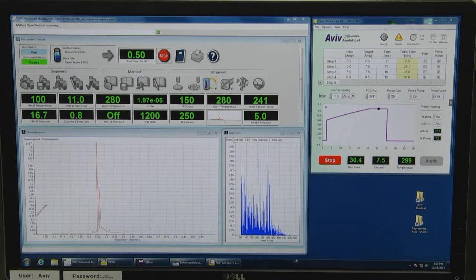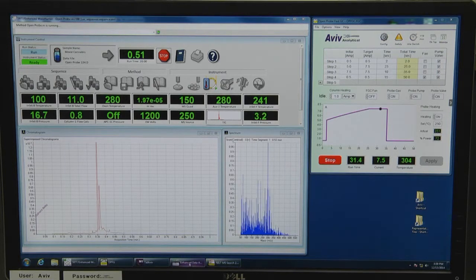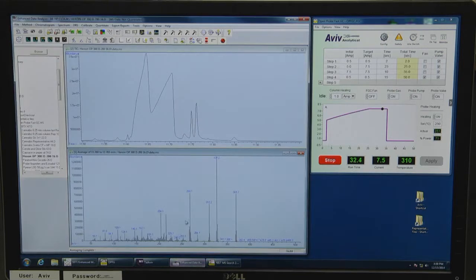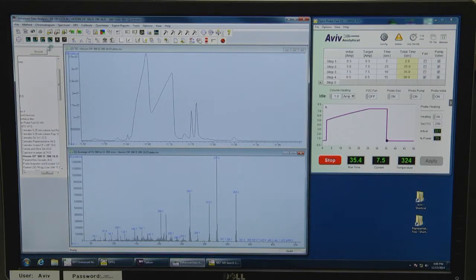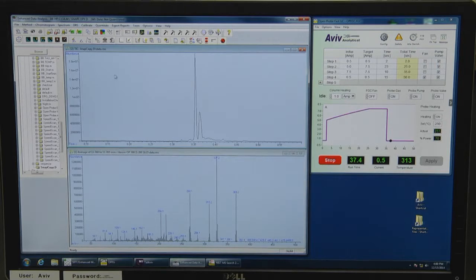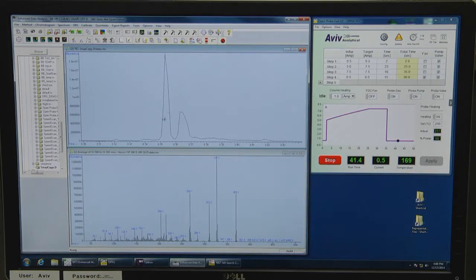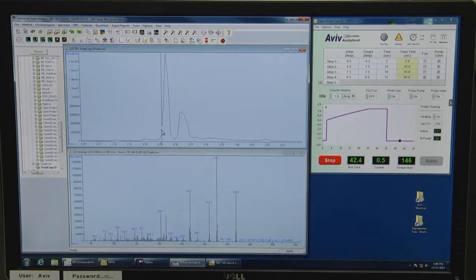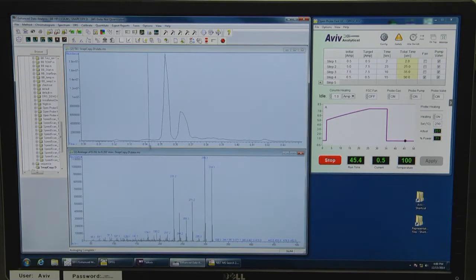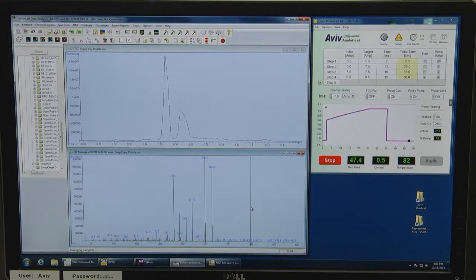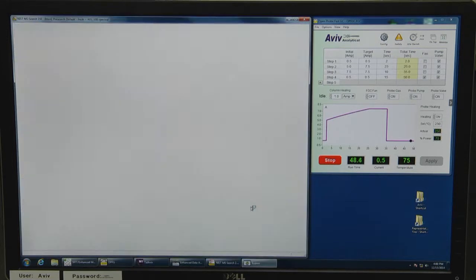Pressing the snapshot camera icon opens the ChemStation data analysis, and after a quick zoom on the main total ion count peaks, we are averaging the main total ion count peak mass spectrum.